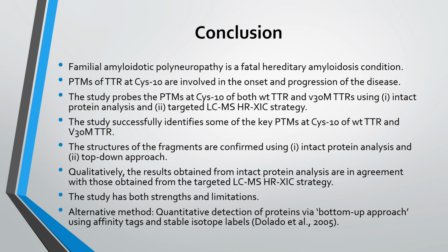In conclusion, the authors could have used a bottom-up approach for their study. This approach allows the quantitative detection and characterization of proteins using affinity tags and stable isotope labels.